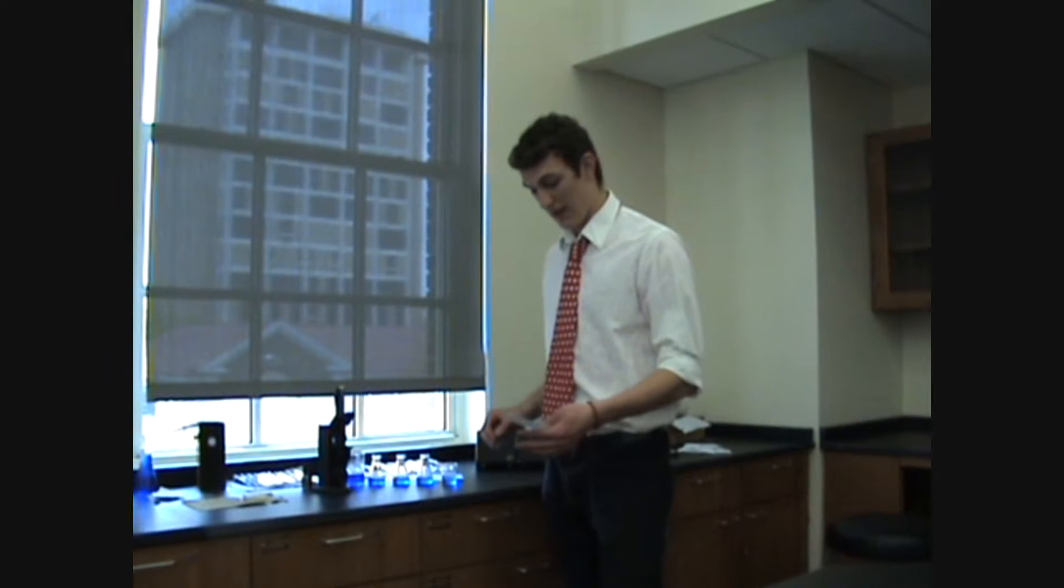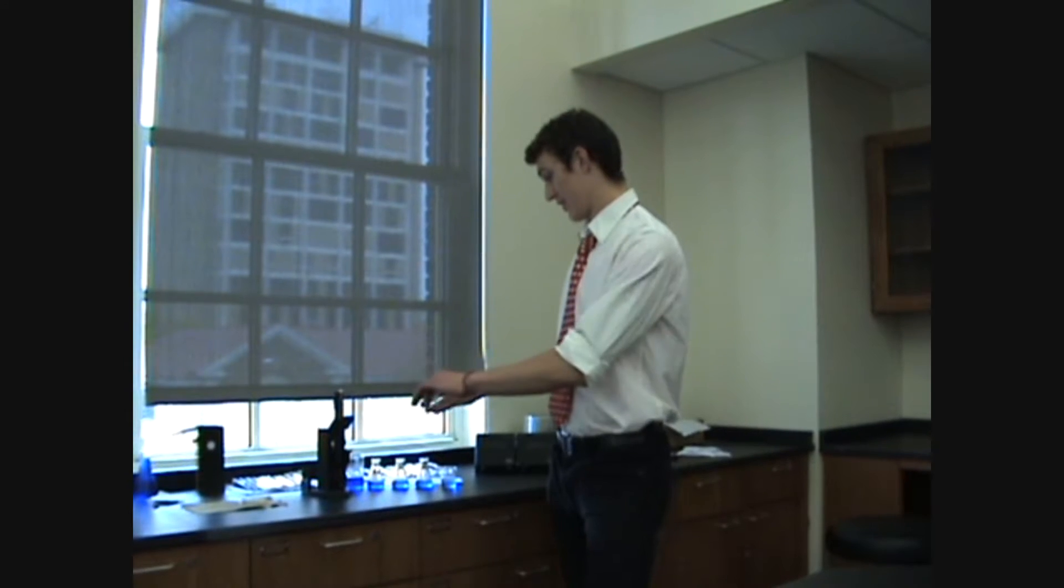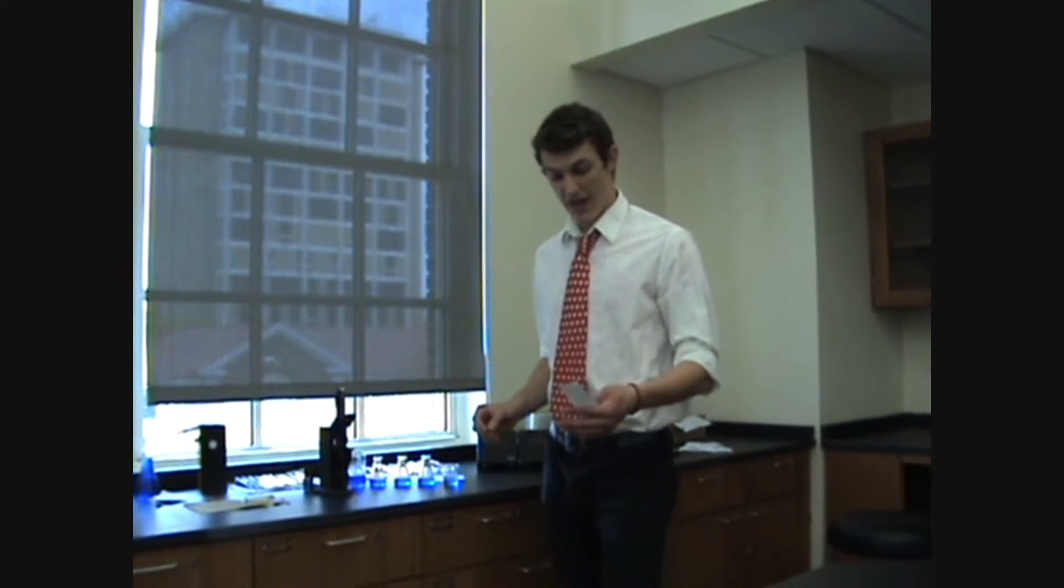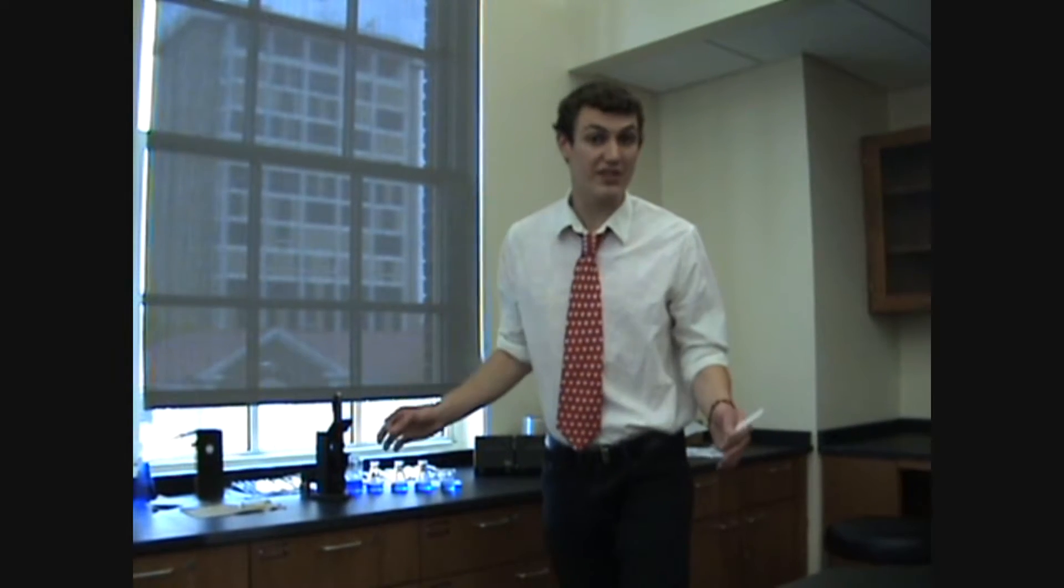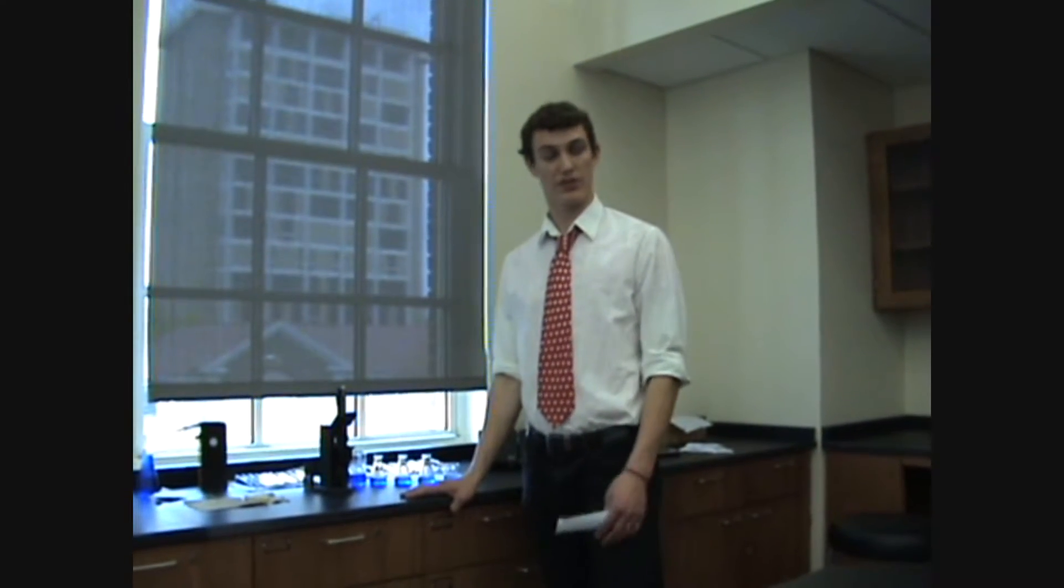However, if you're colorblind, you might have some trouble with this. For disadvantages, you need a really accurate standard to compare your solution with. And it's not very sensitive, so you need large amounts of your analyte in order for this to work. And also, it doesn't really work at night unless you have light or candles to set the biochem mood.